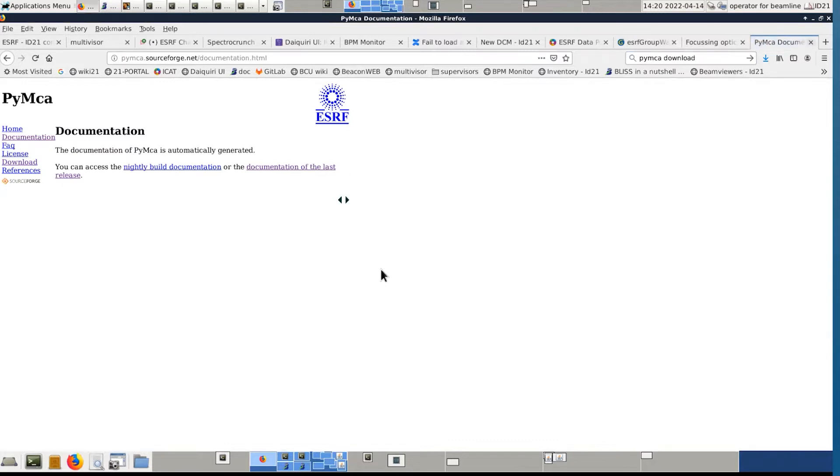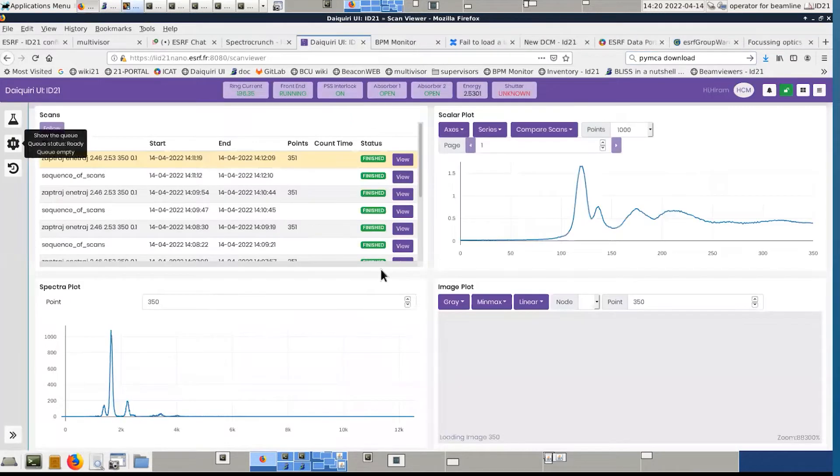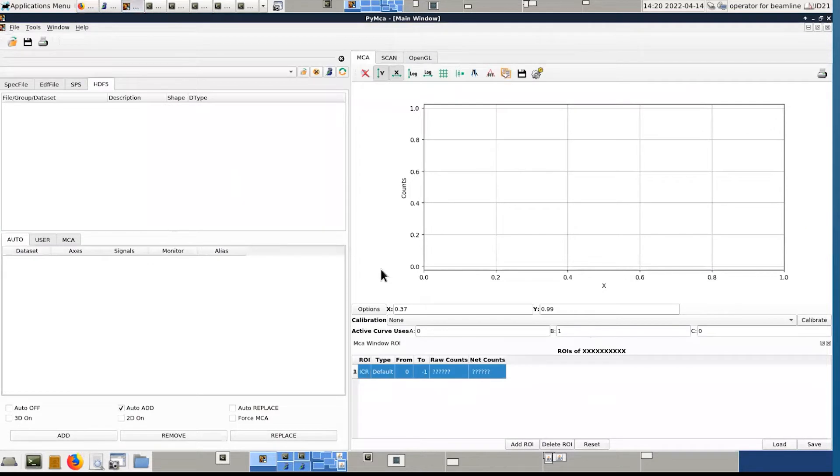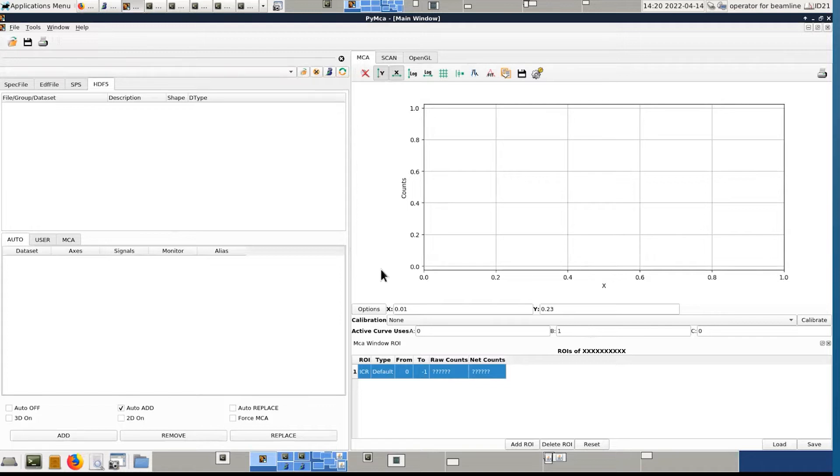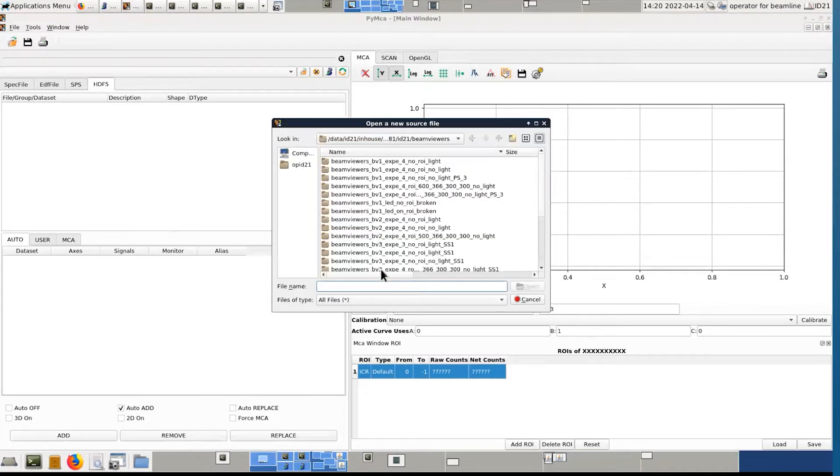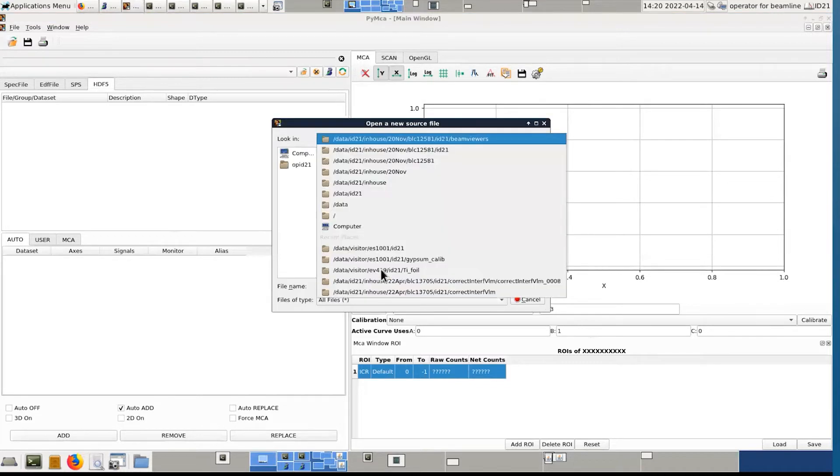So we will start using PyMCA. To open your data, you have either this one or this one. I prefer this one, it's more efficient. So then we need to find your data.